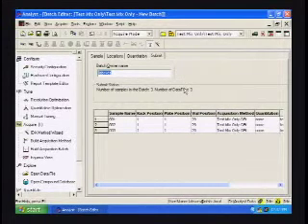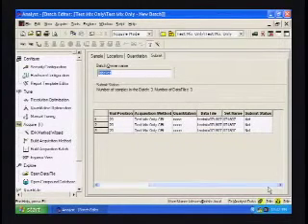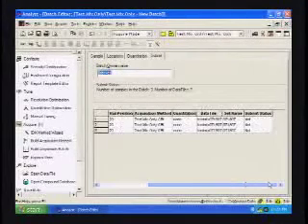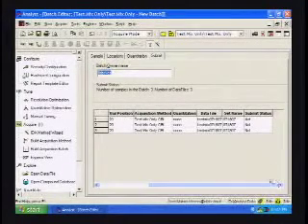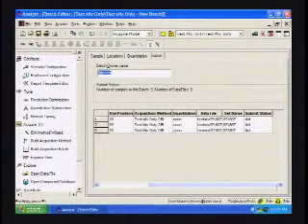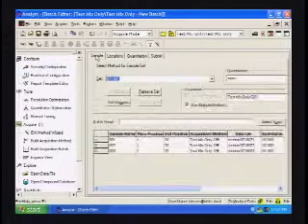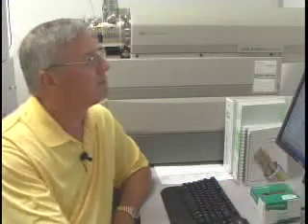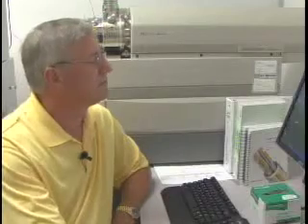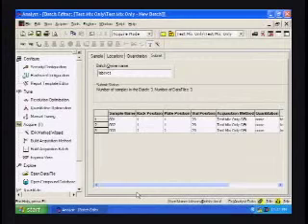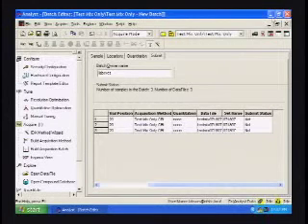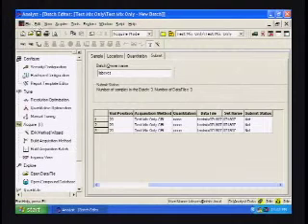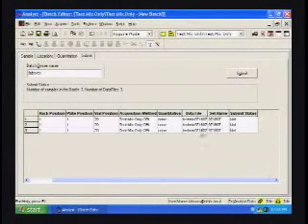I think the submit tab is over to the right. So we'll have to scroll over. Well, it has to be there somewhere. We've expanded the screen so it looks a little different than before. Supposed to be a box up there. Go ahead and minimize the analyst and the whole thing and pop it back open and see if it, you know. Oh yeah, we can get rid of that. So go to view. There you go. There it is.